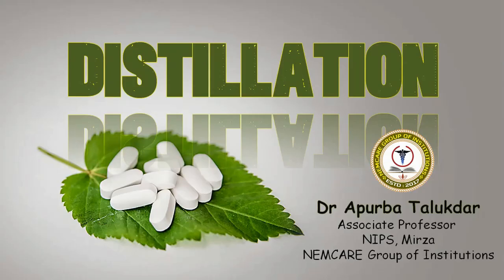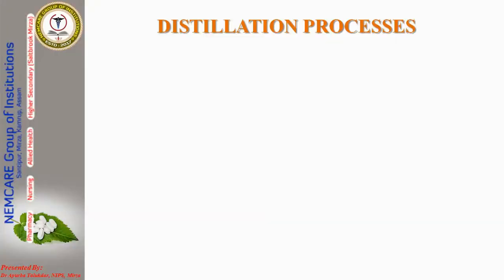Hello everyone. Today we are going to discuss the topic distillation. We are also going to discuss the various equipment used in the process of distillation. Okay, so what is this distillation?